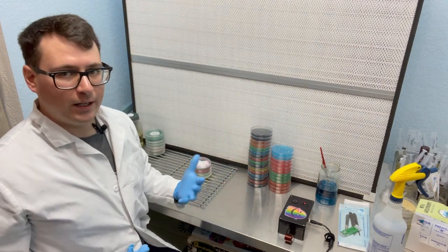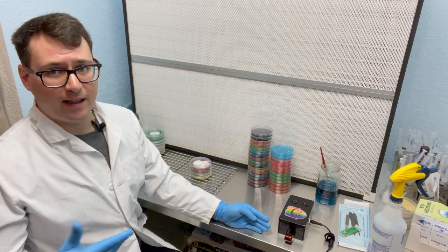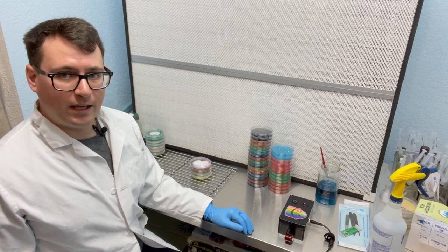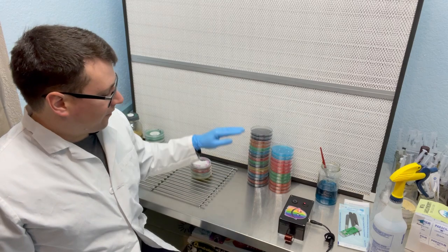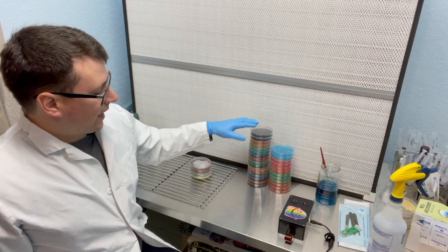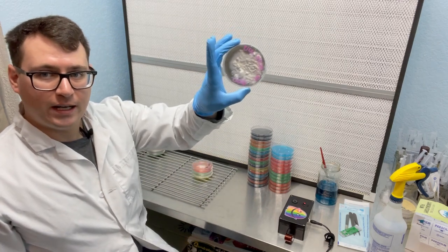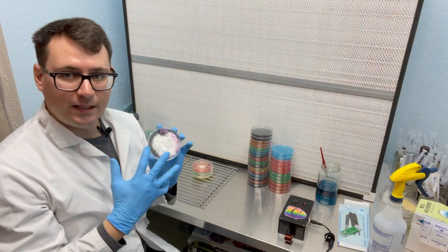Normally I wouldn't sterilize between every single dish. I would only sterilize if I'm switching between species or phenotypes within that species, just so I'm getting a consistent clone of that mycelium. So I'll start off with an initial sterilization, and then I'm going to do probably about 4 or 5 transfers per culture here. And all of these cultures have different mycelium morphologies.